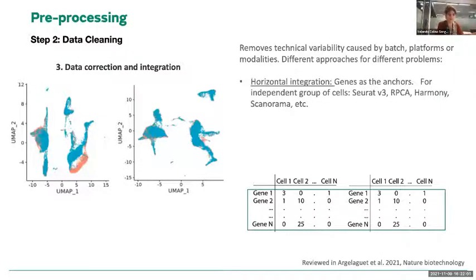But obviously you have one separate FASTQ file for each of your samples and one different count matrix, and then you want to combine them.